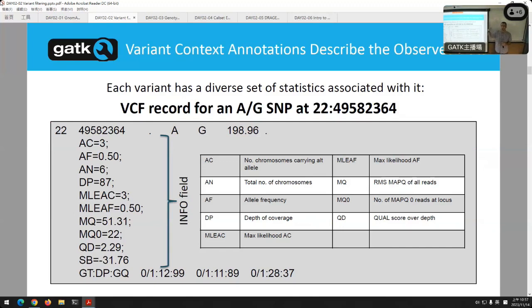And in the next module, I'll explain to you the difference about the genotypes. This is whether the site is real or not. And so that's quality. So this is a Q score. So remember, Q90 is 99.9999999% confident. This is even more confident than that. So this is probably a real site.